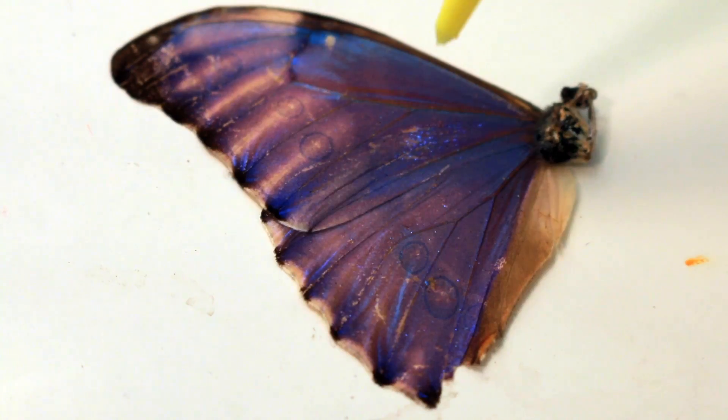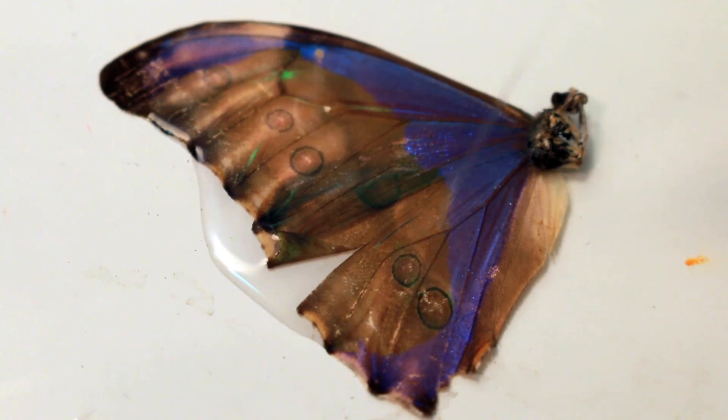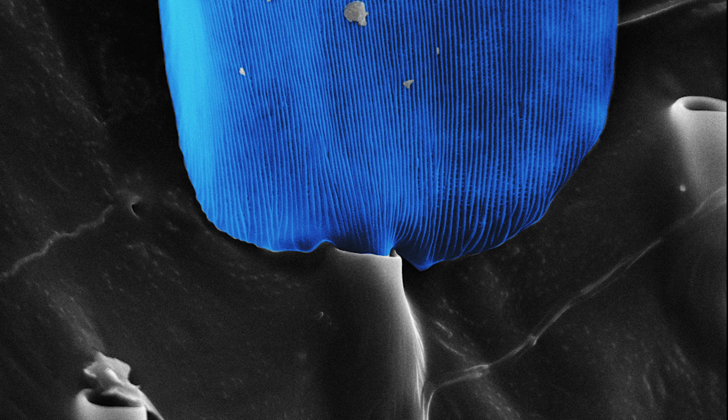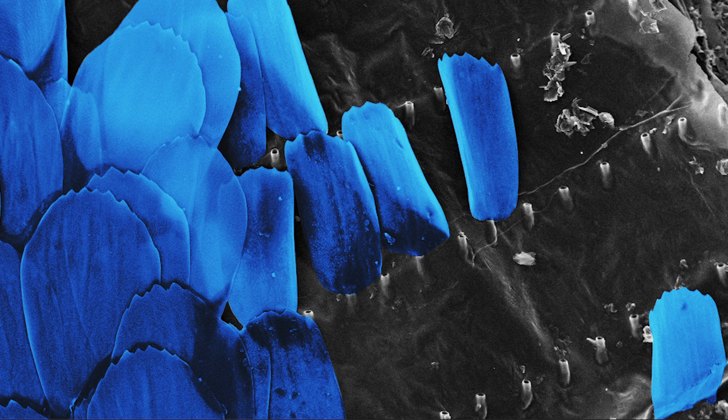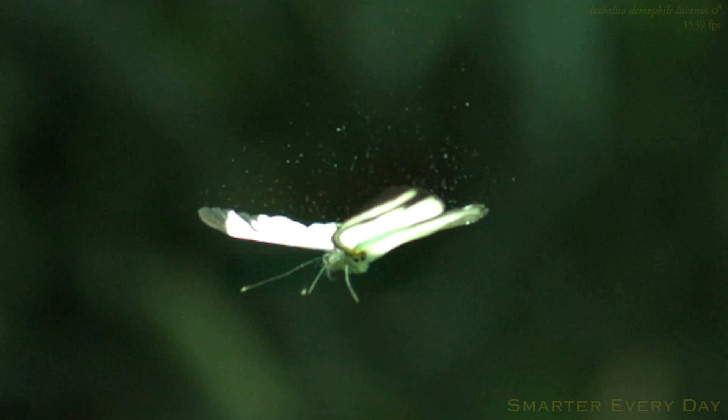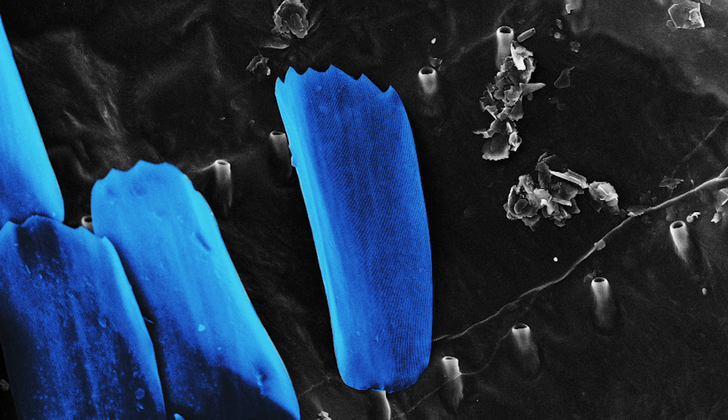So there you have it — butterflies use nanotechnology to lie about their color. But we still haven't answered our question: how are these scales attached to the wing? It's almost as if someone deliberately planted trees in a nice evenly spaced row. I think it's beautiful. Through normal wear and tear, even aerodynamic drag along the wings, these scales are somehow plucked out of these roots, leaving these hollow stumps.